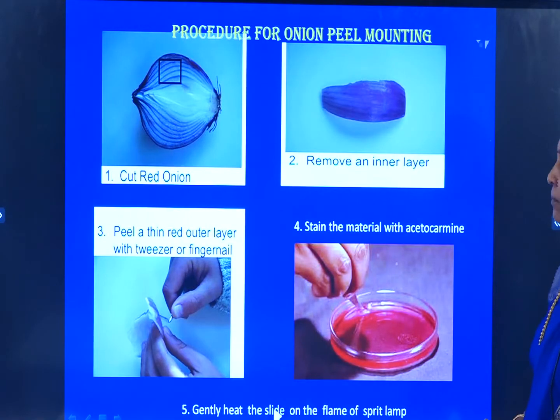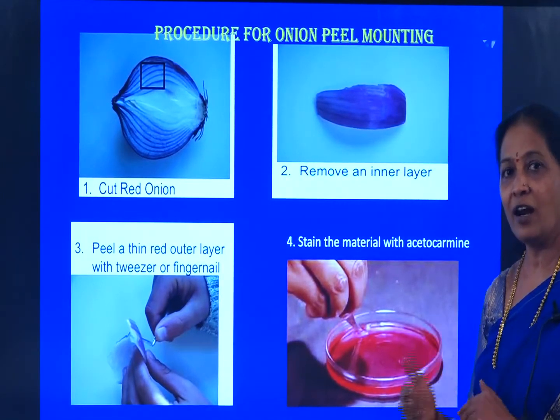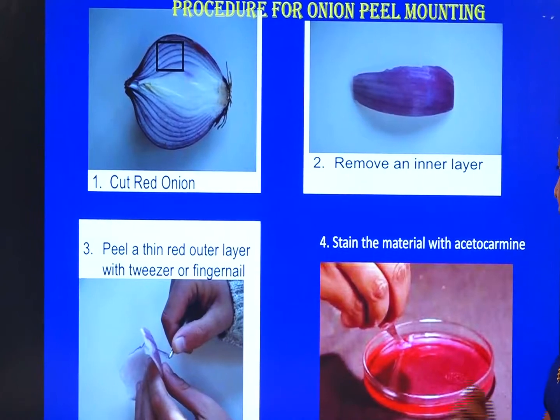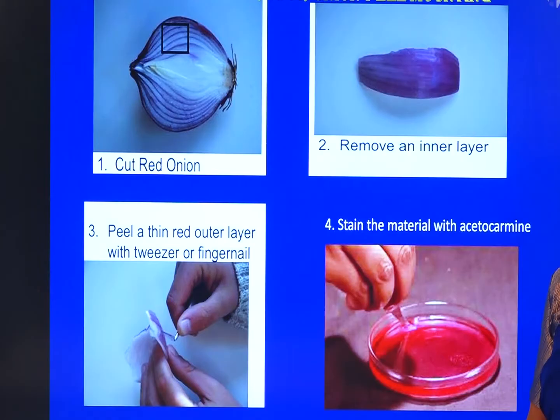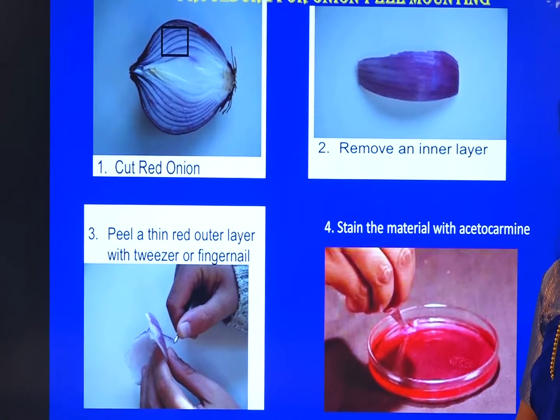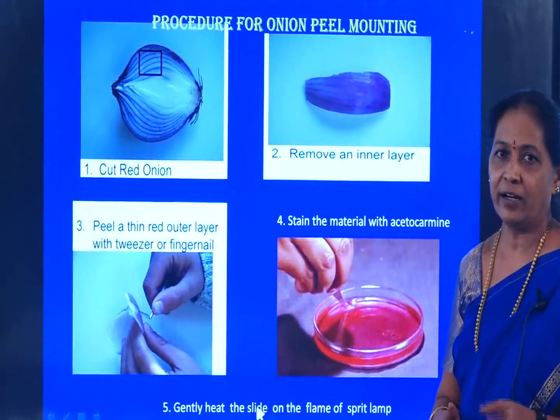This is the procedure for Onion Peel Mounting. What we need to do is cut the onion and take the fleshy scale leaves. That fleshy scale leaf is where we use forceps to remove the epidermis. Drain the stain, then mount the slide and gently heat the slide on the flame of the spirit lamp. The nucleus takes the stain and it appears red in color when we view the slide under the microscope.